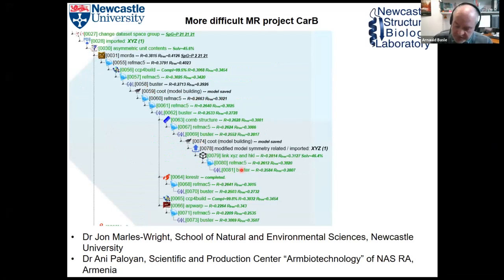So here, the point I'm trying to illustrate using CCP4 Cloud, but that is true for any other interface, is: try everything. You never know what will work. And at the end, if it solves your data, you will be really happy.